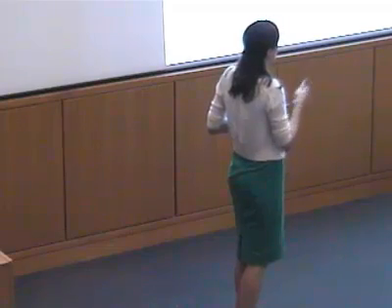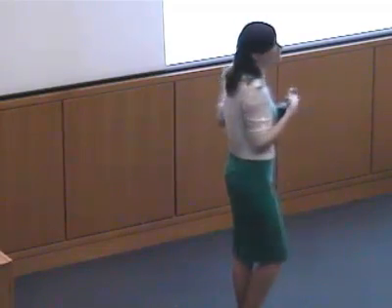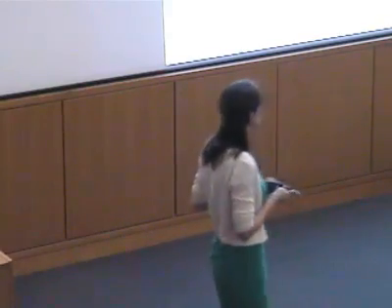Now, obviously, if we know what the unit is, we can link these parameters and reduce the variables. So that's something else that's helpful. But this just gives you an idea of what this kind of looks like. So the thing about the multiple scattering that's also very useful, even though it looks a little bit complicated, is that it inherently can provide us with some angular information.